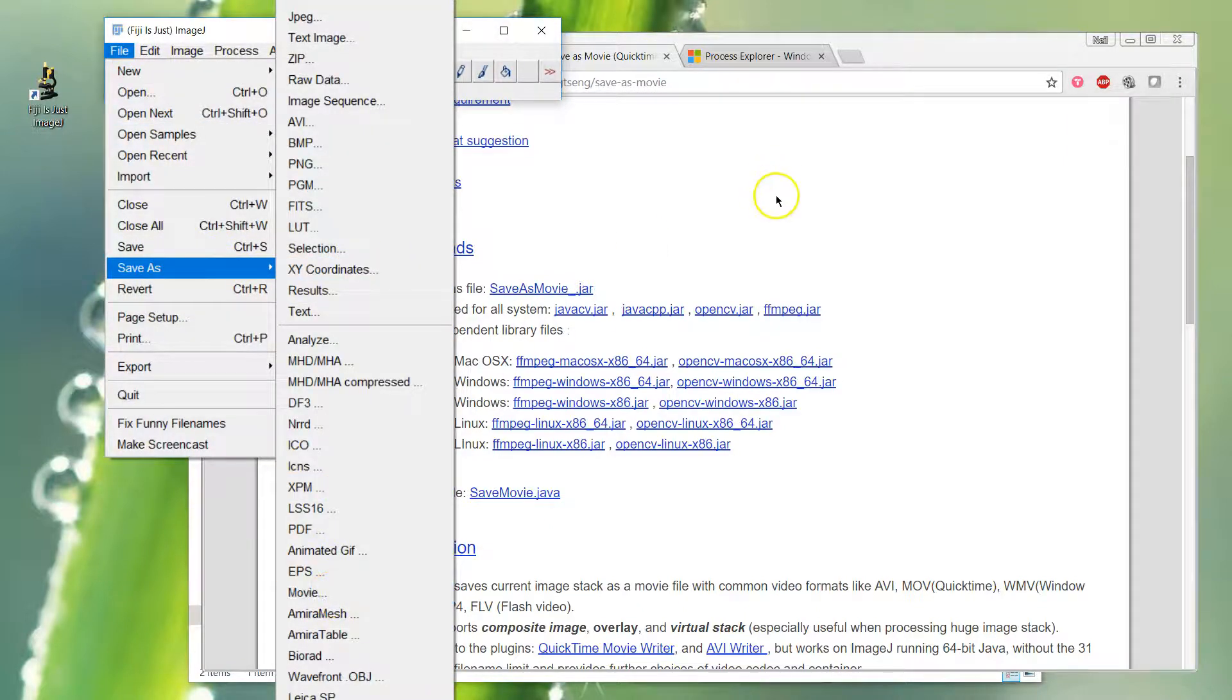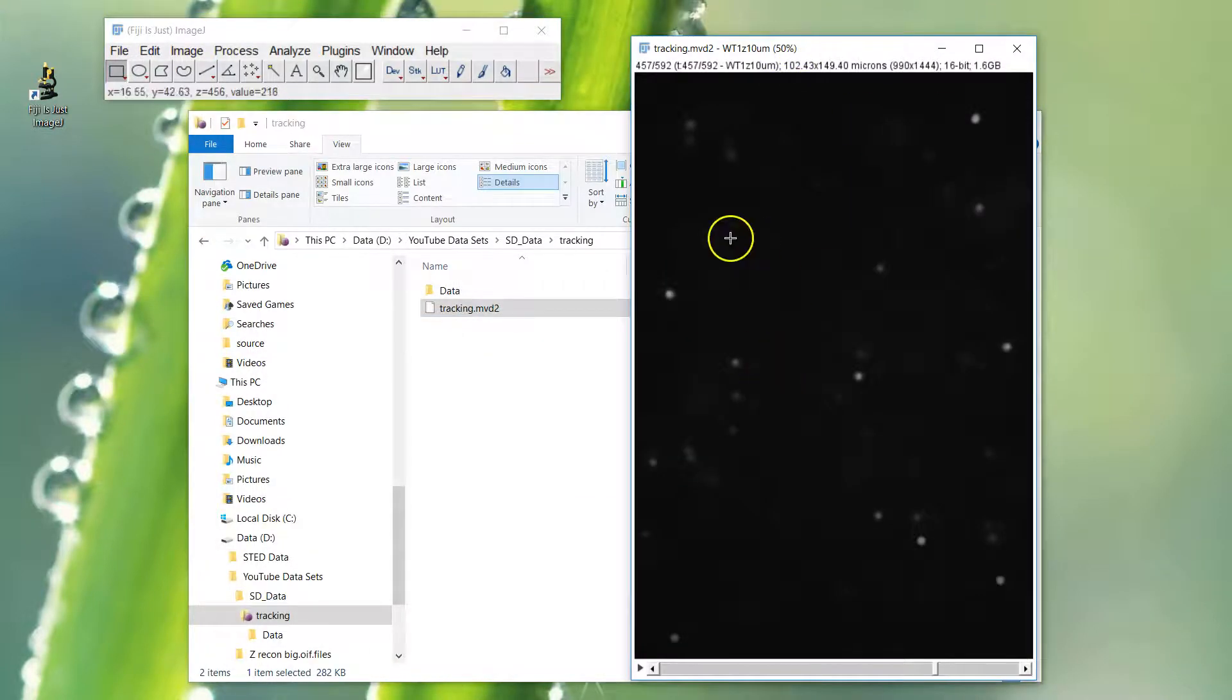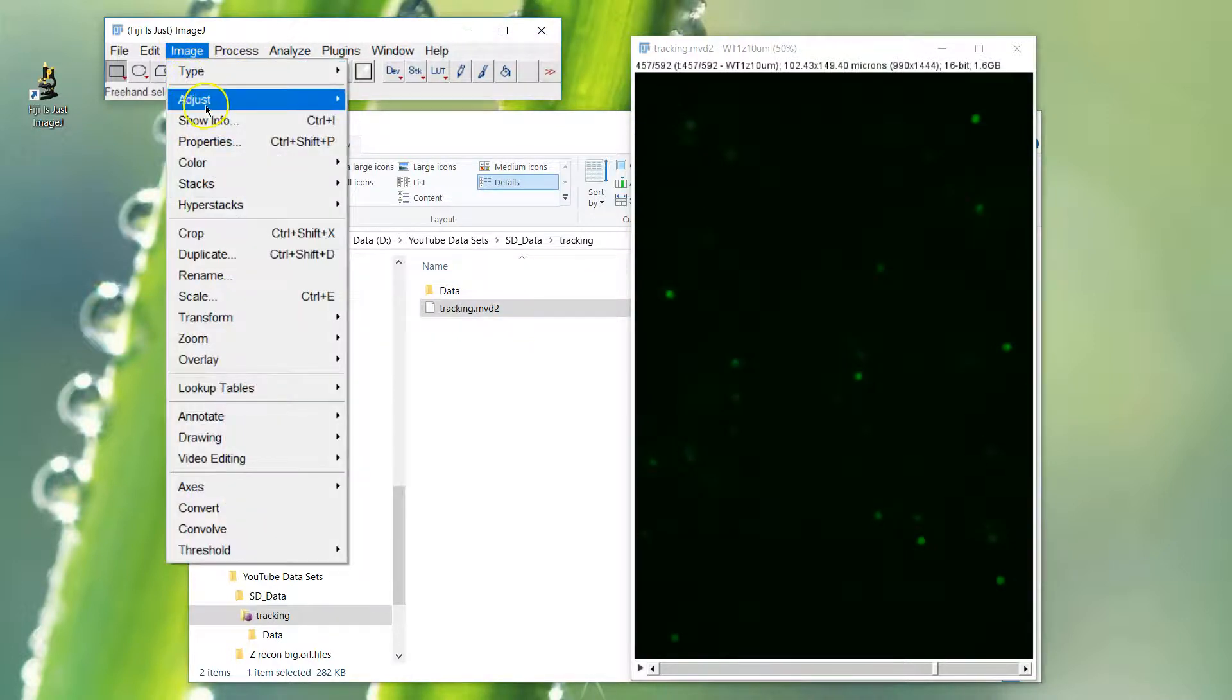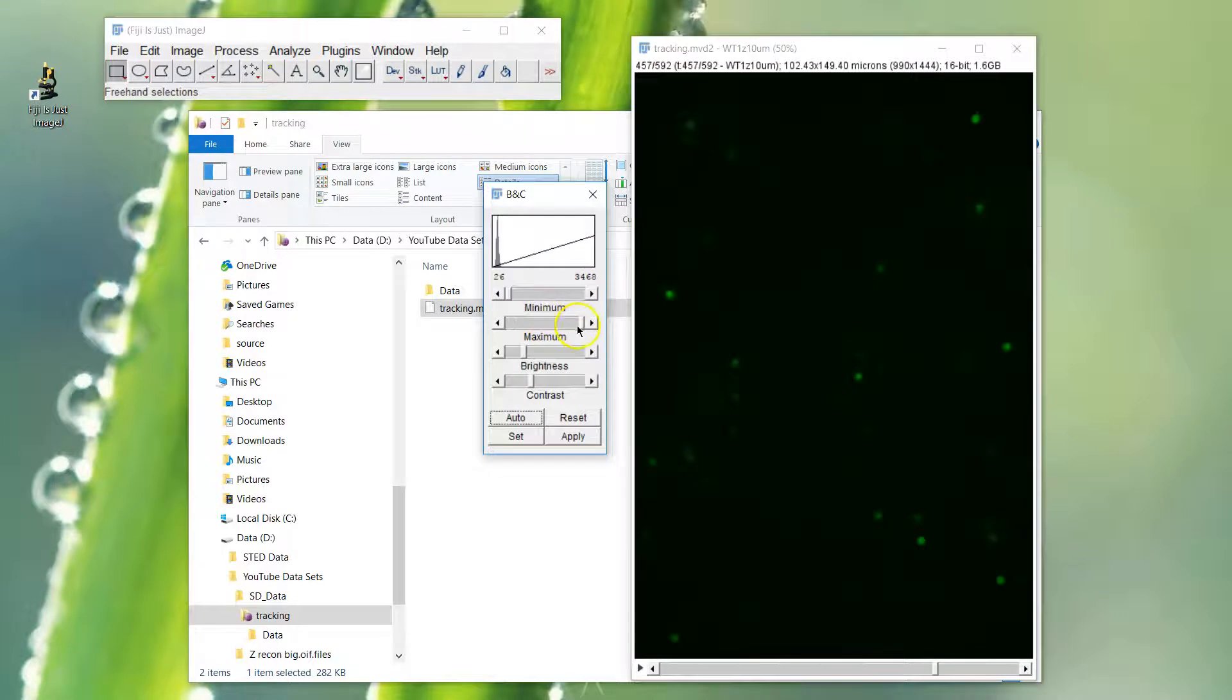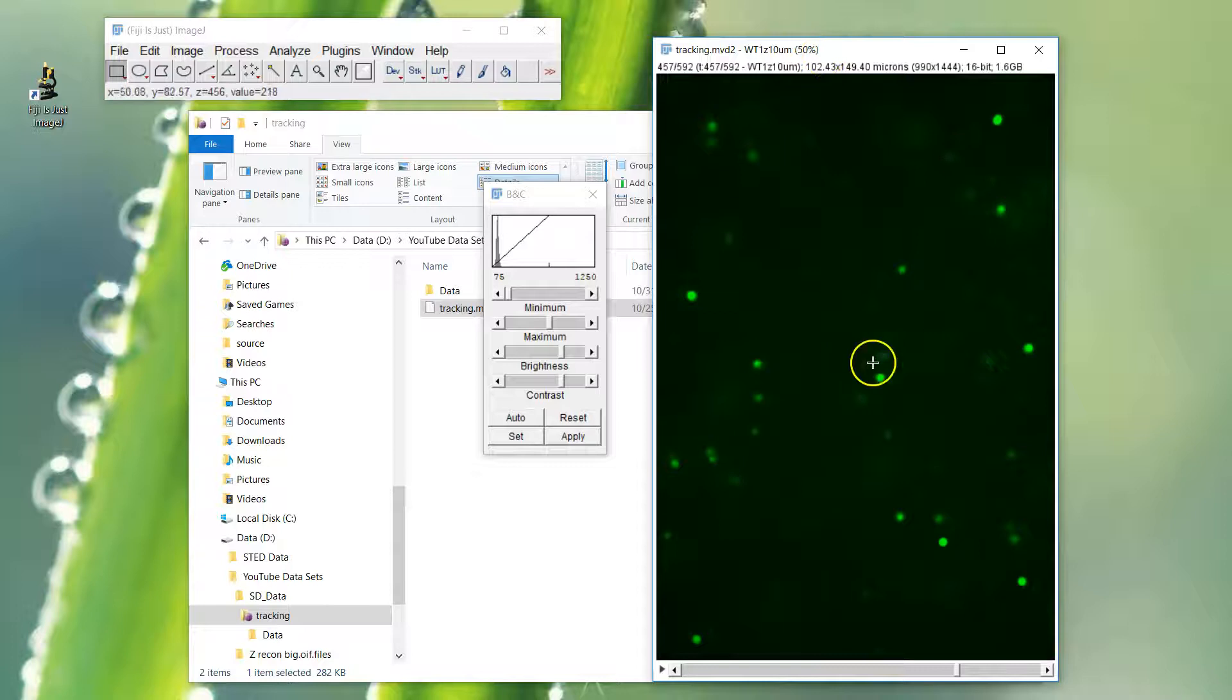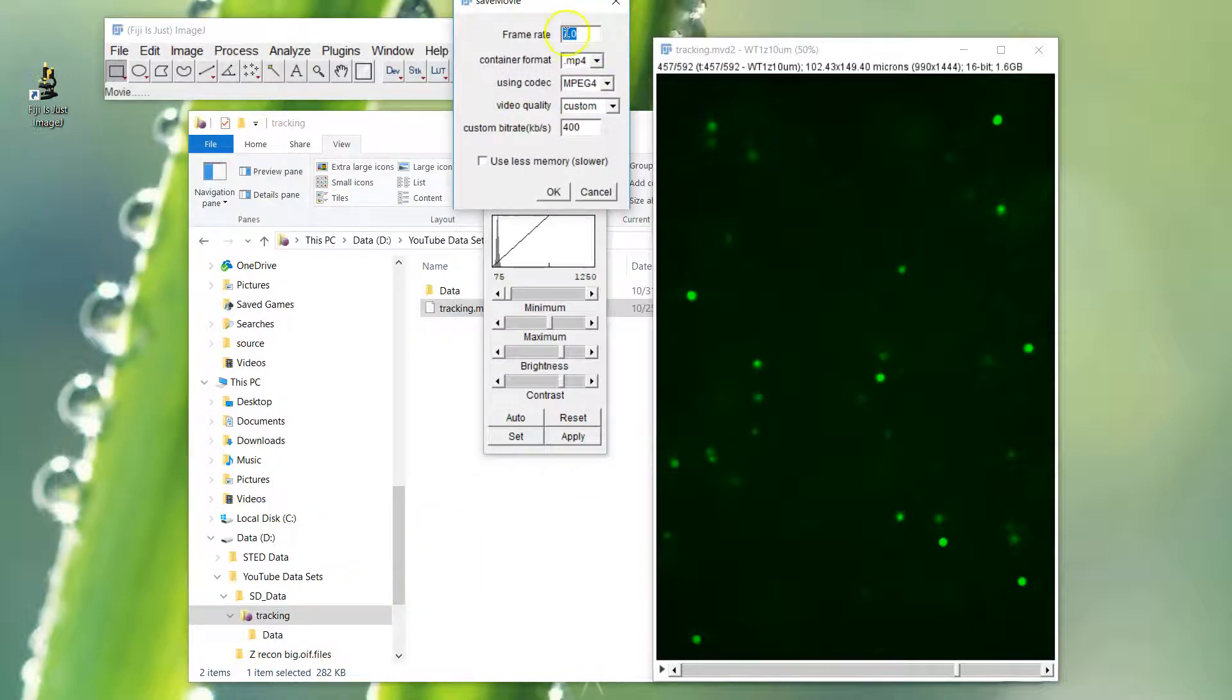Before we do that, let's just take a look at the image. We're going to change it to green and do contrast (Control+Shift+C) just to make it stand out a little bit. When you export a movie in this fashion, it will export exactly what you see on the screen.